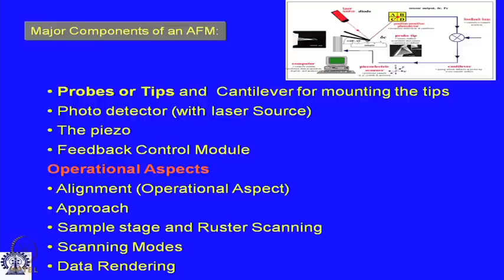We have a piezo element. Depending on the model, we can have one or three piezo elements. I hope you understand what is a piezoelectric material. It's very simply put, a special class of material across which if you apply a voltage, it changes its dimension. Or in other words, if you can change the dimension of a piezoelectric material, a voltage sort of gets generated. Here we typically use it in the first mode, that is, we apply a voltage which corresponds to the error voltage, and based on that, the piezoelectric material changes its dimension.